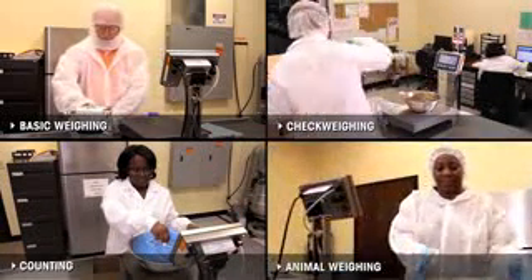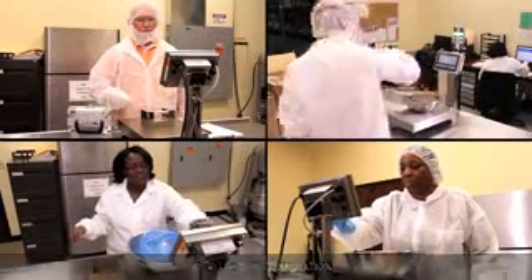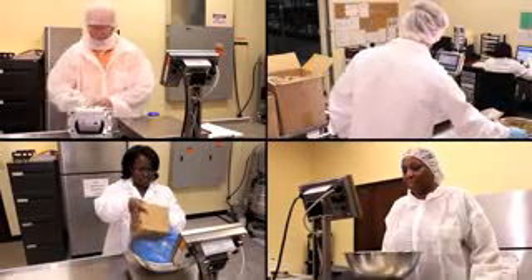Whether you need a terminal for a basic weighing procedure, check weighing, counting, animal weighing, or weight accumulation, operators with an IND231 or IND236 terminal get the job done faster and with fewer errors.